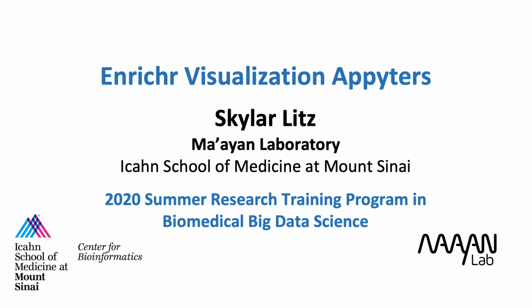I'm Skylar Litz, and I will be presenting on the project I've been working on this summer as a trainee with the Mayan Lab. My project was to create appyters that produce unique visualizations, both static and dynamic, of enrichment analysis data.